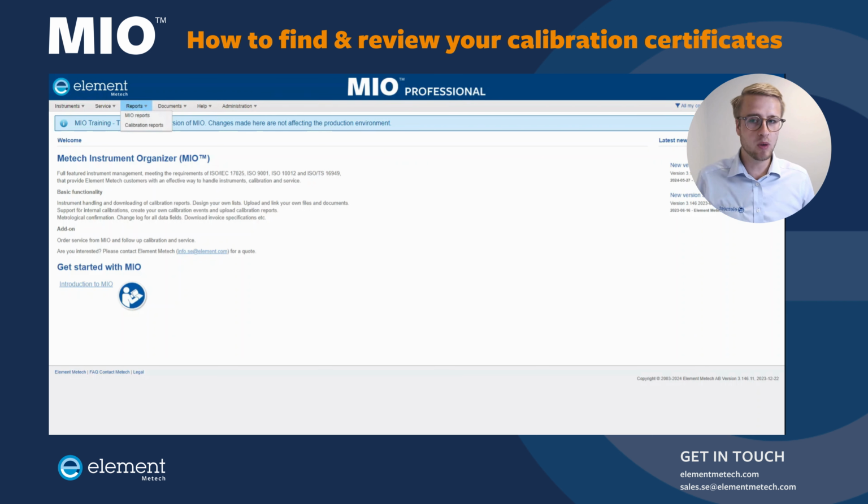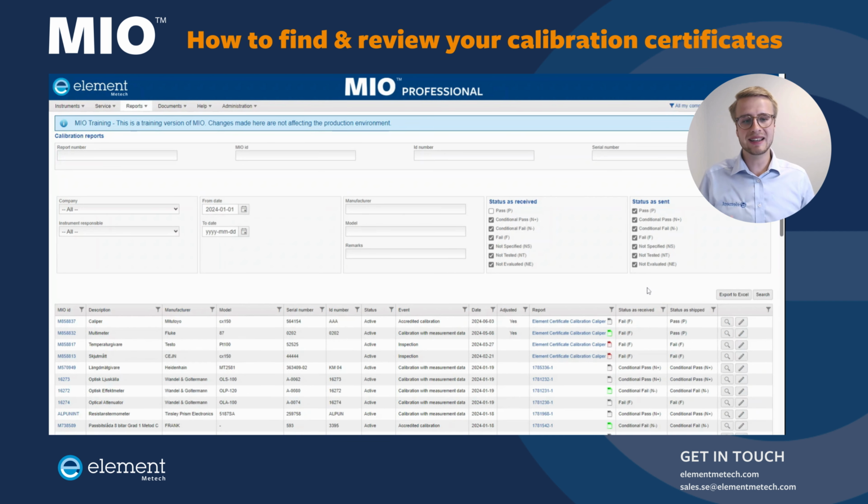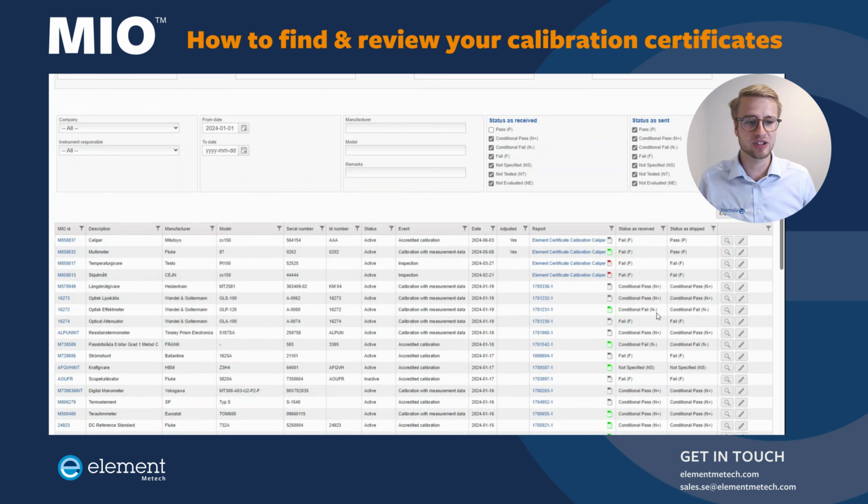If you go into Reports, Calibration Reports, you're able to do a conditional search based on different criteria. So I'm going to search for those calibrations that have been performed this year and those that did not pass the calibration when it was calibrated as received. So I'm going to check those boxes, then I'm going to click search, and then I will get a list of all instruments that did not pass the calibration.